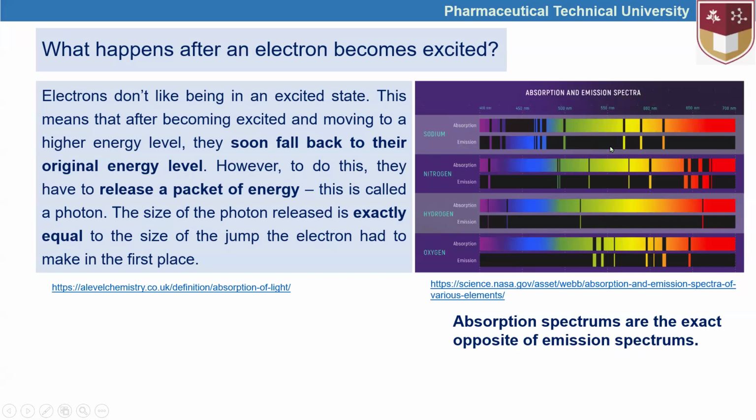The meaning is, okay, sodium has its own absorption spectrum, and these are the spectrum of the light that is absorbed by the sodium atom to have the electrons excited from the ground state to a higher energy state.